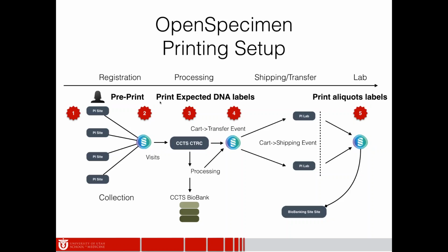This is Sri here, Randy. You said in the next few weeks you'll probably go live with the first lab. How many protocols does the first lab have, and how many users will be using the system? There aren't a whole lot of users. In this particular lab, there are 6 or 7 users, and there are 2 protocols, 1 main protocol. The reason we're starting with this one is because it's the most complex.